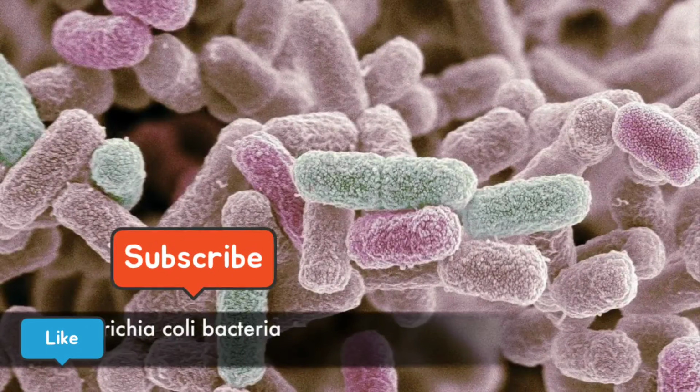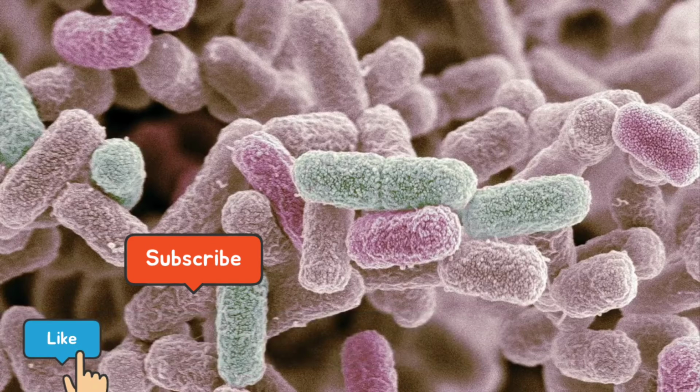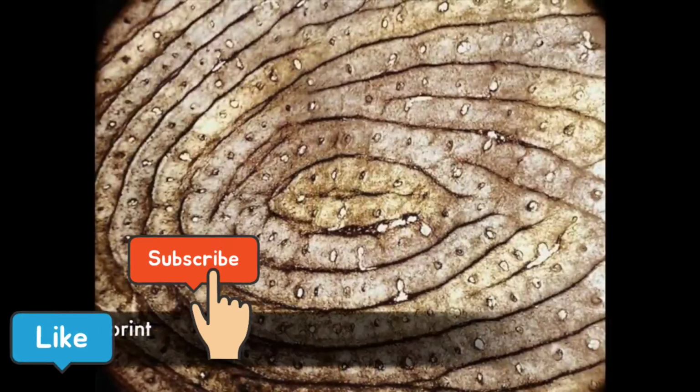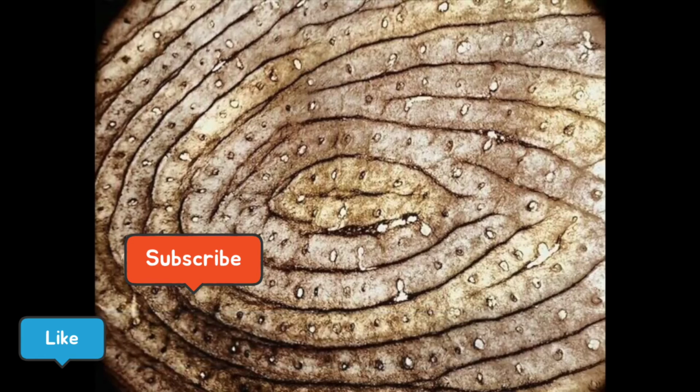E. coli are gram-negative, rod-shaped bacteria that are part of the normal flora of the human gut. Some strains produce a toxin that causes severe diarrhea and can be fatal, especially in the very young or elderly. A human fingerprint showing the epidermal ridges. The image is magnified 35 times.